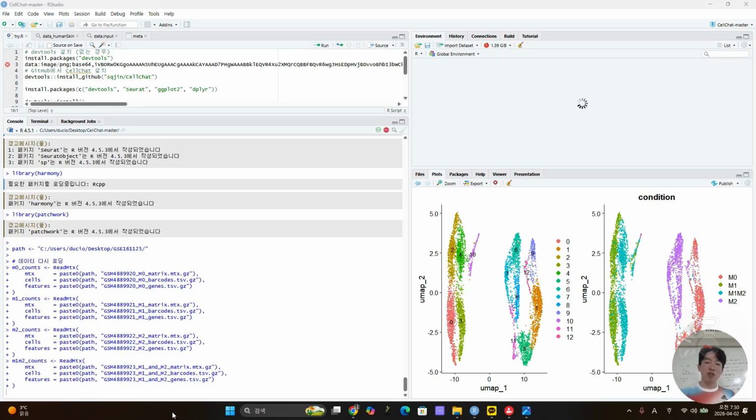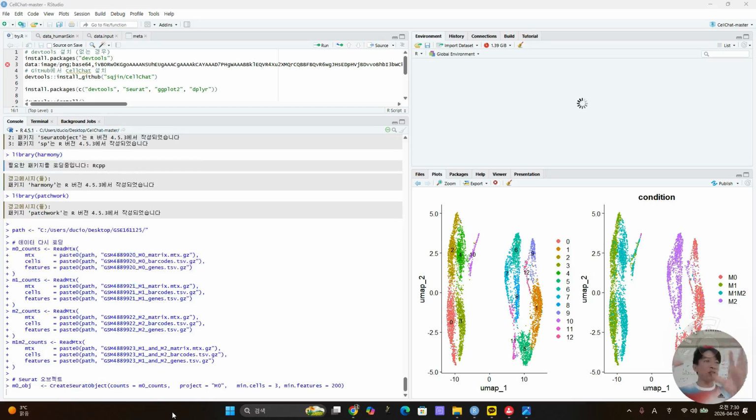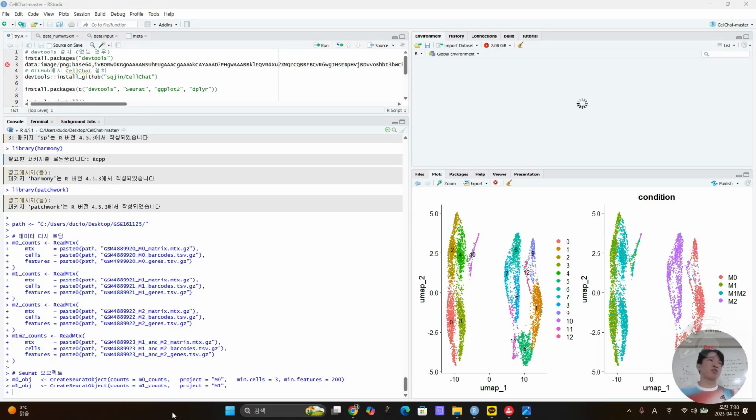If you want to follow a certain figure in a paper, copy the figure, paste here and say, I want to make this figure. They will direct you how to analyze it using code. So that's the whole thing. This is one direction they are doing. For other things, just copy and paste the error, and then copy and paste the correction.